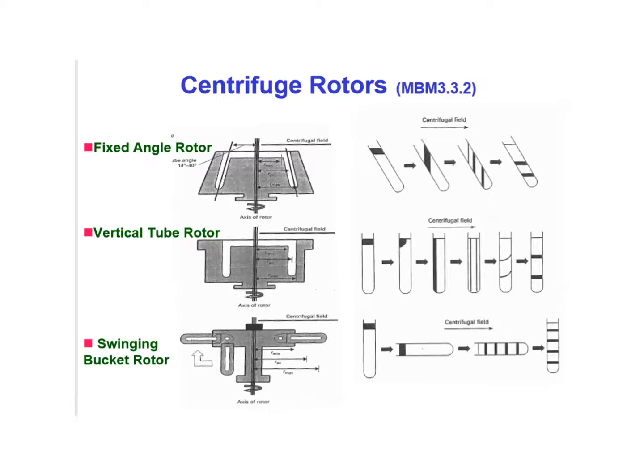And this is showing, here's 5 materials at different density. This would be high density. This would be lower density here. Okay, so you can see right away we get a separation by density from low to high. So think about that when we're separating materials here.